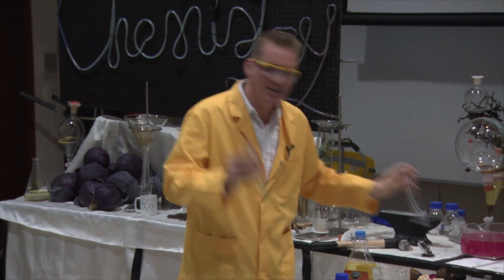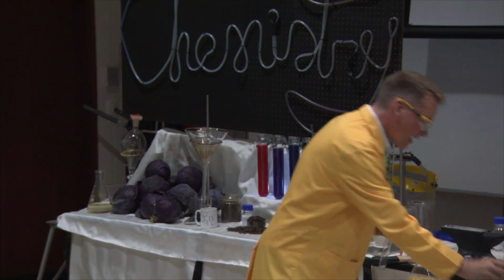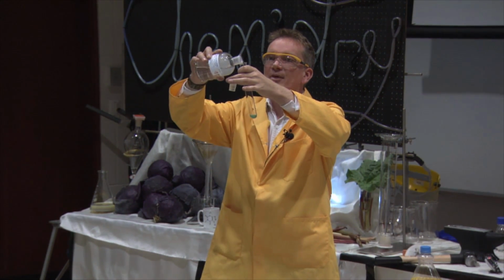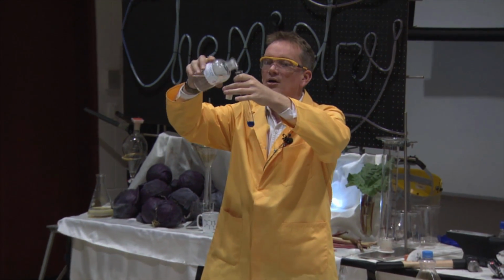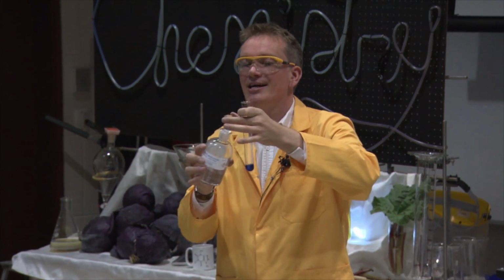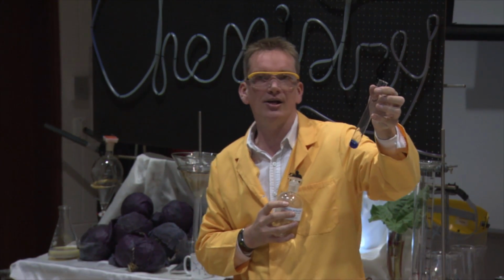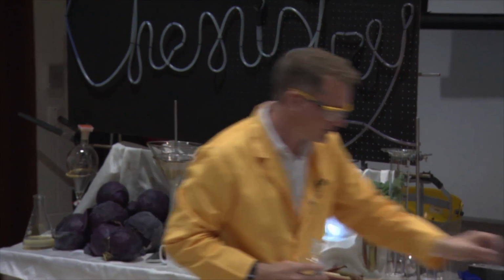It says, if we take some of our solution, so I'm just going to take a little bit of this solution here, and if we add some ammonia, this is what I've got here, ammonia solution, well, adding the ammonia to the solution that we suspect of containing copper, we get a beautiful dark blue colour. And that's as the ammonia is interacting with the copper ions that are in the solution there. And we form this complex that has a beautiful, beautiful dark blue colour. That confirms the presence of copper, tells us not to eat our pickled onions.